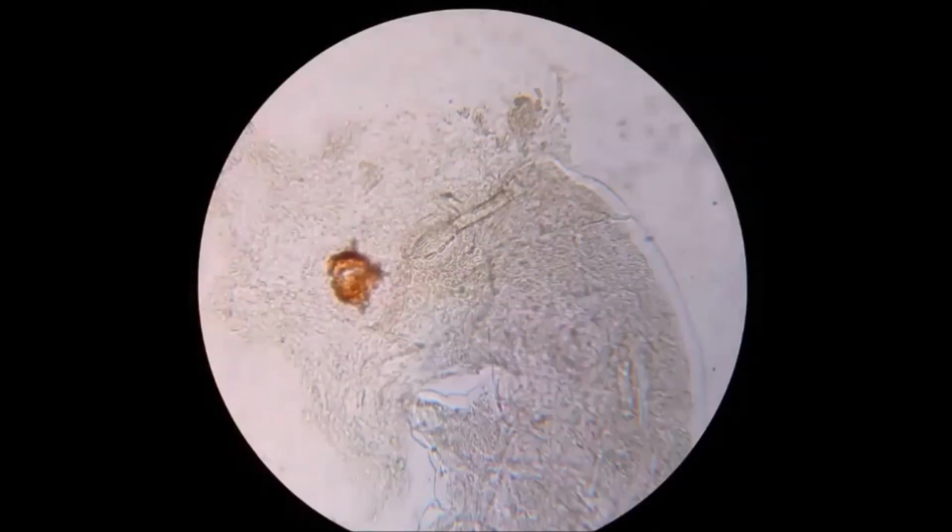So at this point, I realized that the cloud around the head might actually be some of the body fluid, the haemolymph, coming out. And over time, it became obvious that that was the case. The bulb broke through the cuticle, and all of this haemolymph and cells just started pouring out of the body. And so over time, the tardigrade lost the ability to move its legs. There just wasn't enough fluid and cells to support movement anymore. And it was really quite sad to watch, but this was the result.